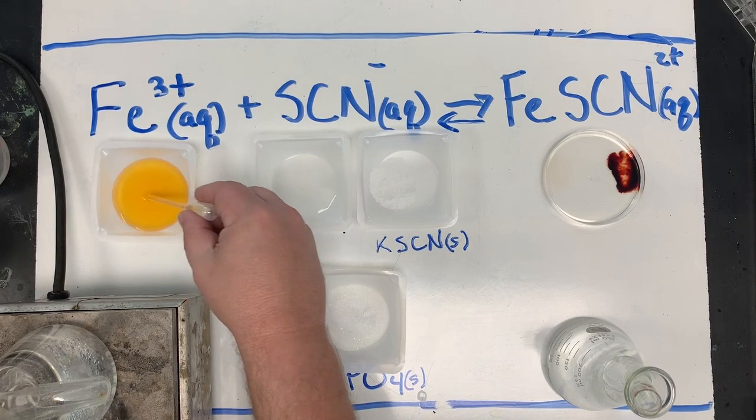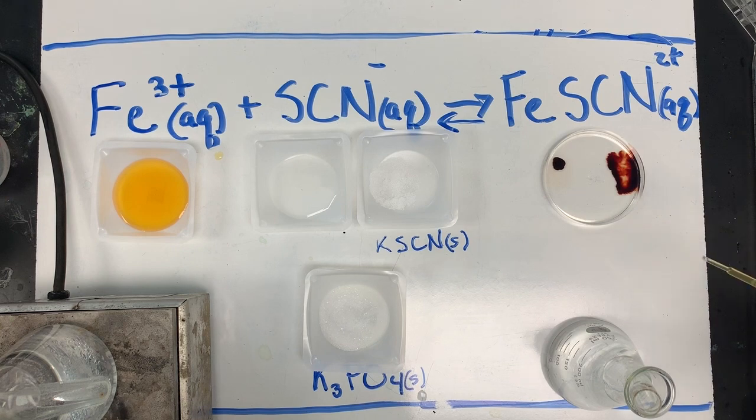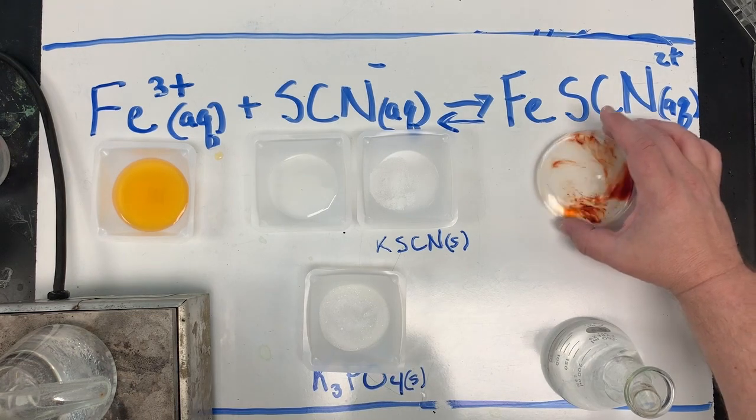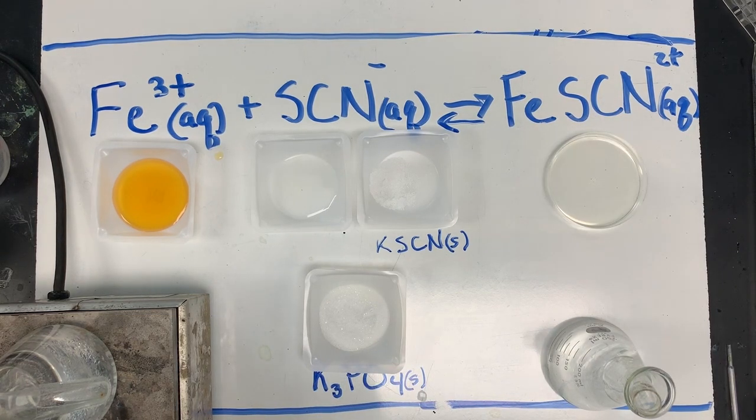Another little drop of this right here. And another little drop right here. So we'll go ahead and swirl our solution. What happened?